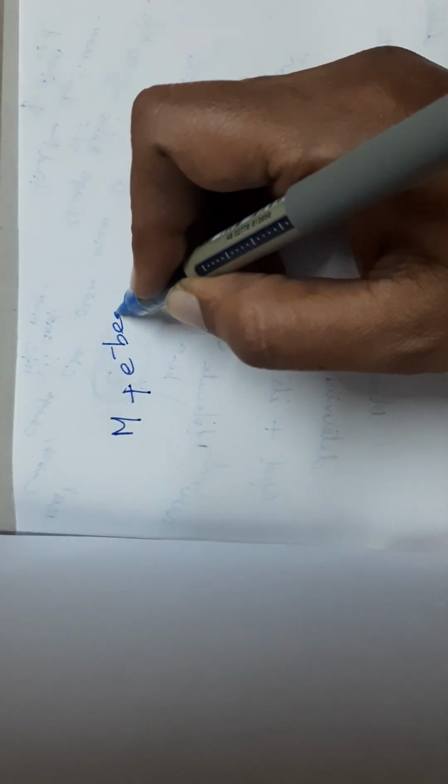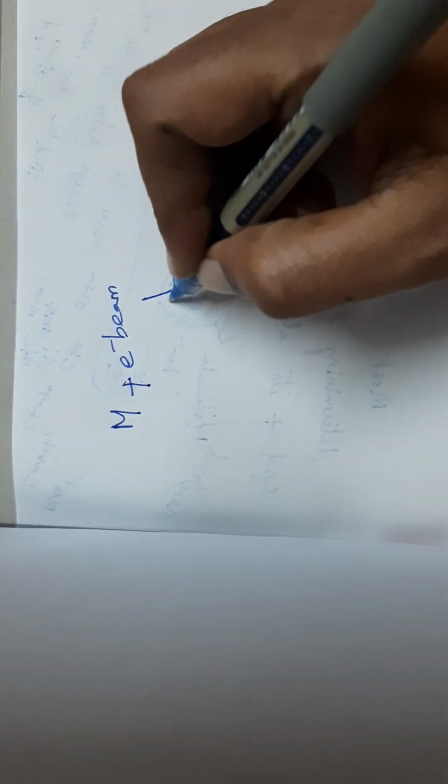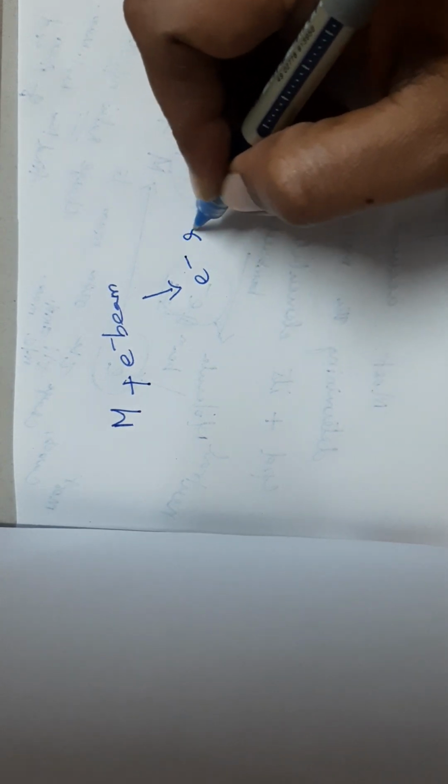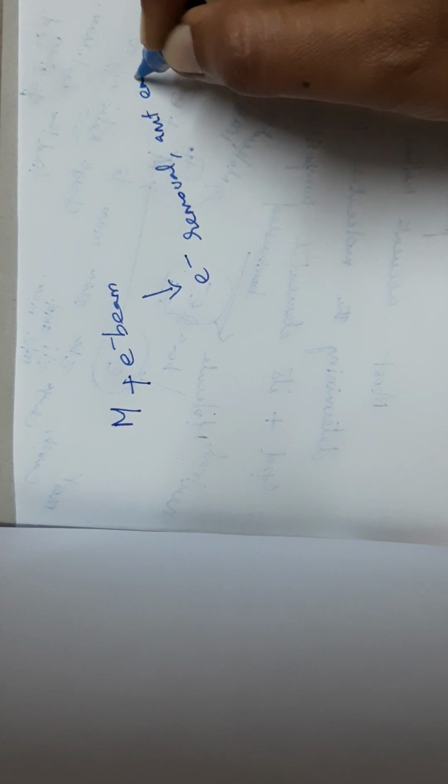Now I said that when this molecule is getting bombarded with the electron beam, what happens? Along with the electron removal, some amount of energy will also be liberated.